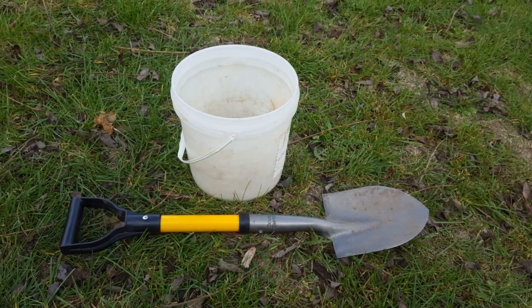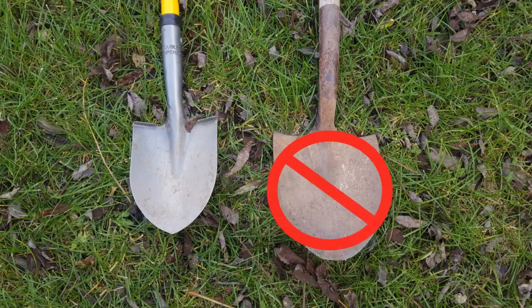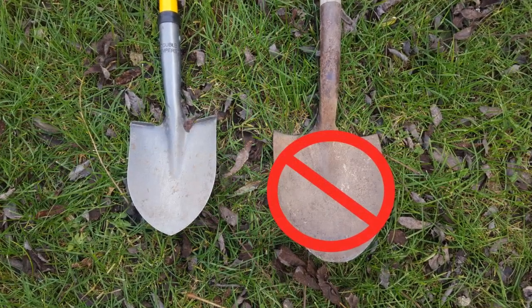For equipment, all you need is a plastic bucket and a clean shovel. Don't use anything rusty or galvanized.